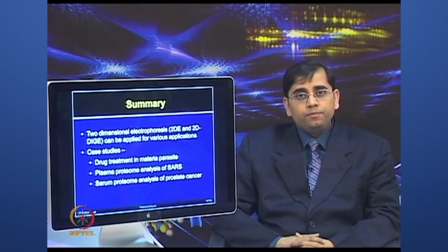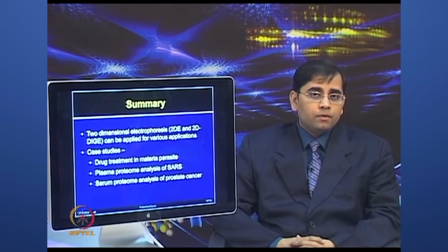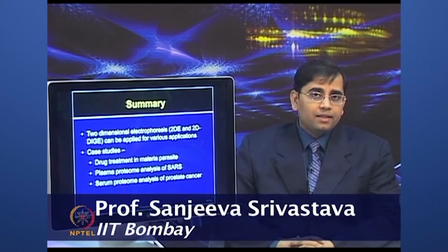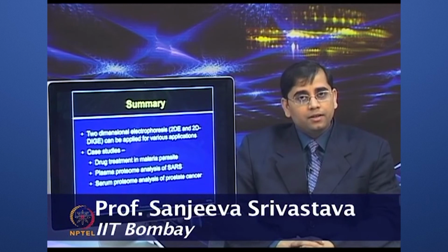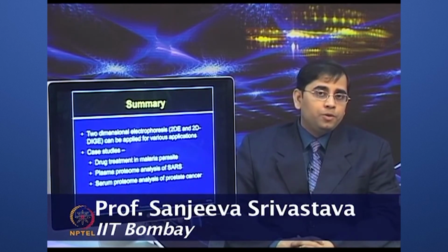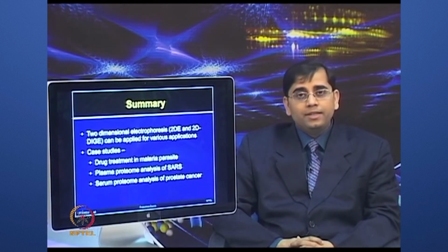But regardless of the pitfalls of each of these techniques, you may appreciate that there is a lot of power in these techniques, and these can be employed for any biological application. You pick an application of your choice, and I am sure you will be able to answer those by employing 2D or 2D DIGE techniques.